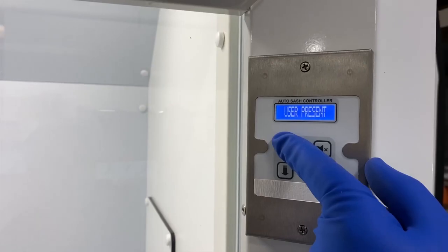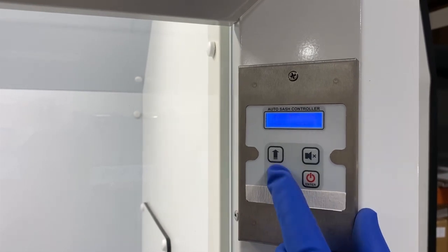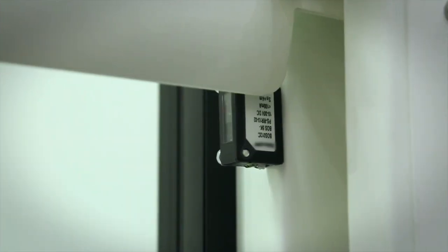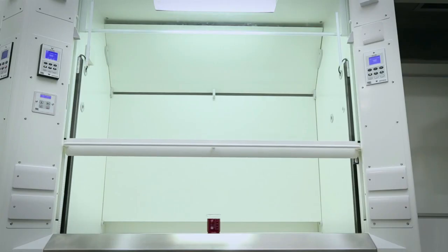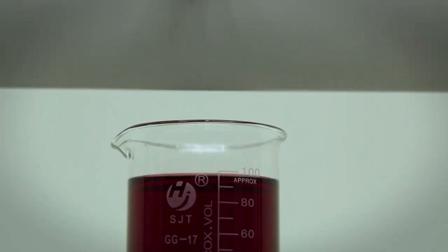The sash can also operate manually or by using a keypad. The under-sash sensor creates a single beam under the sash handle. If at any point during the closing sequence the infrared beam is broken, the auto sash drive will be disabled. When it's removed, the auto sash will automatically reset.